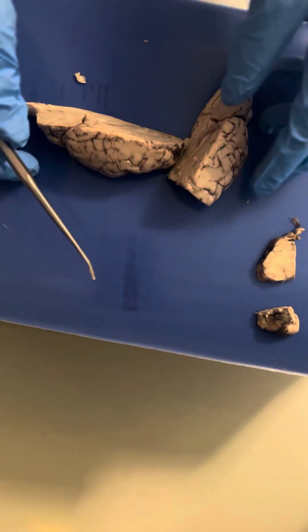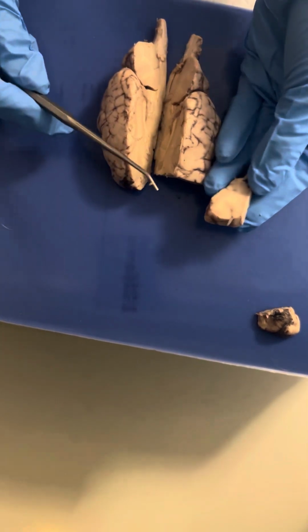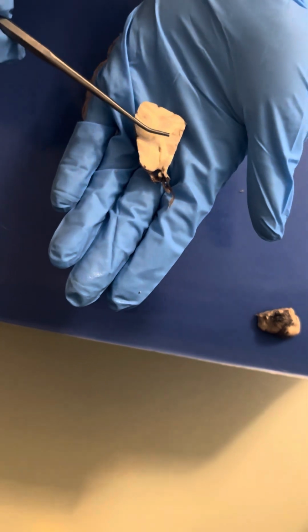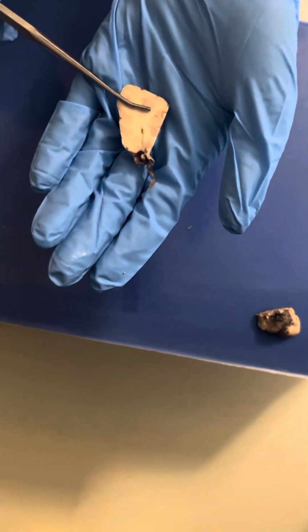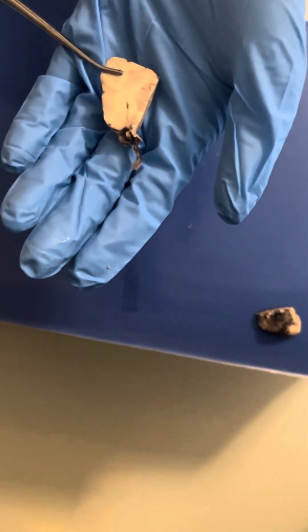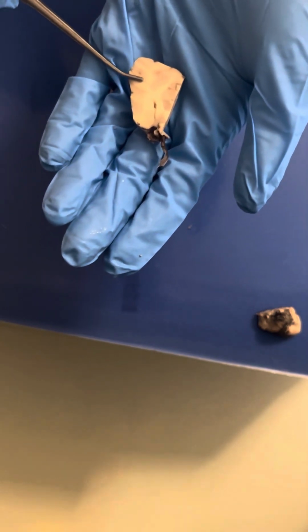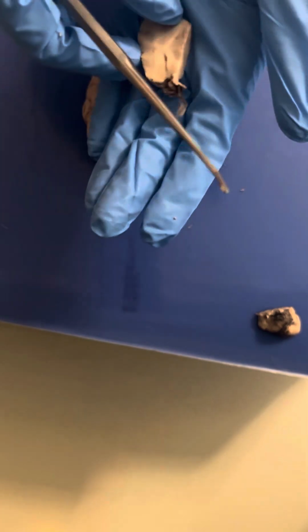So lastly, if you cut the cortex, which is why this section is missing right here, you can see the gray and the white matter. Oh, here's a better one. The gray matter is right there. It's on the outside and is made of cell bodies, dendrites, and unmyelinated axons. I never can pronounce this word, and I've Googled it 5,000 times. And then the white matter right there is made up of the myelinated axons.